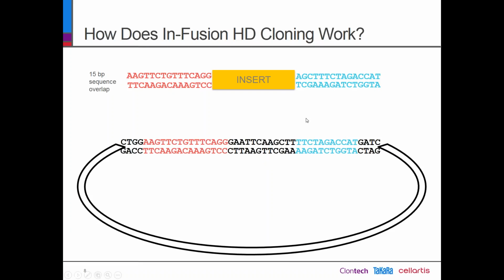So inverse PCR means that you don't PCR just this fragment, but you go actually all around the vector, and like this you get a linear fragment of your vector. And what you then do in either case, whether you cut here with the restriction enzyme or with PCR, is you look at the sequence at your ends.